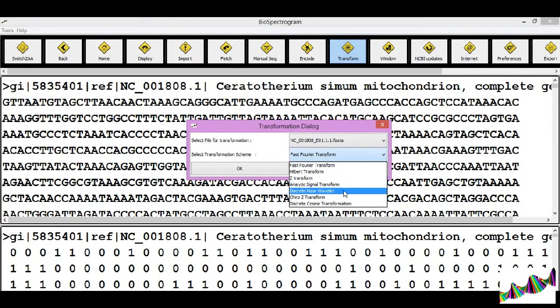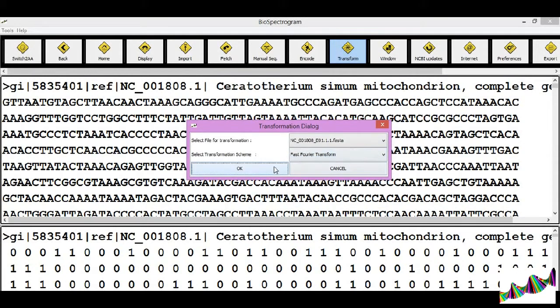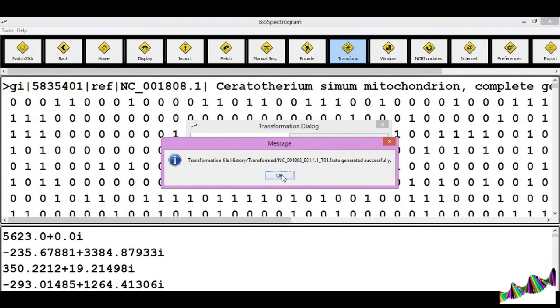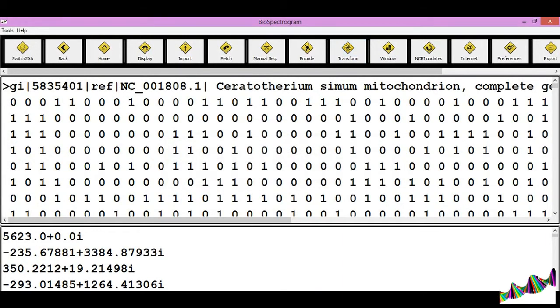Select the type of transformation. As an example, fast Fourier transform, and click OK. The transform file is also saved in the history folder.